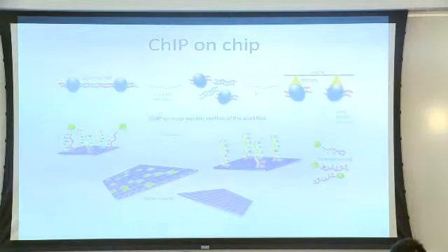So this is close to the end of my remarks, but I wanted to show just 3 variant techniques that you may have heard about and which fall under the umbrella of ChIP. And I think ChIP is our topic here, so I thought these would be fair to mention very briefly. This is a method called chip-on-chip, which in many ways is the precursor method of ChIP-Seq that we use today.